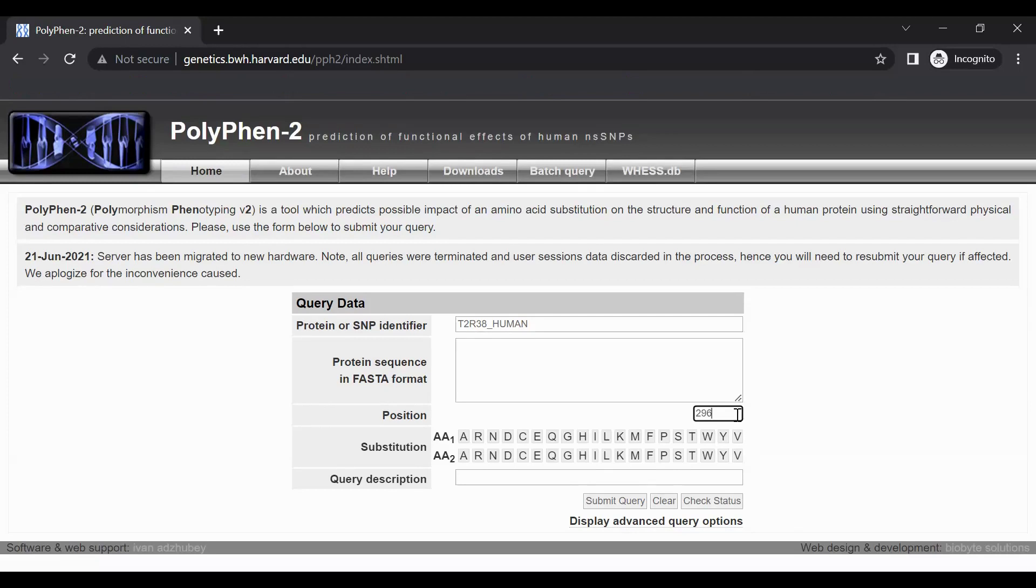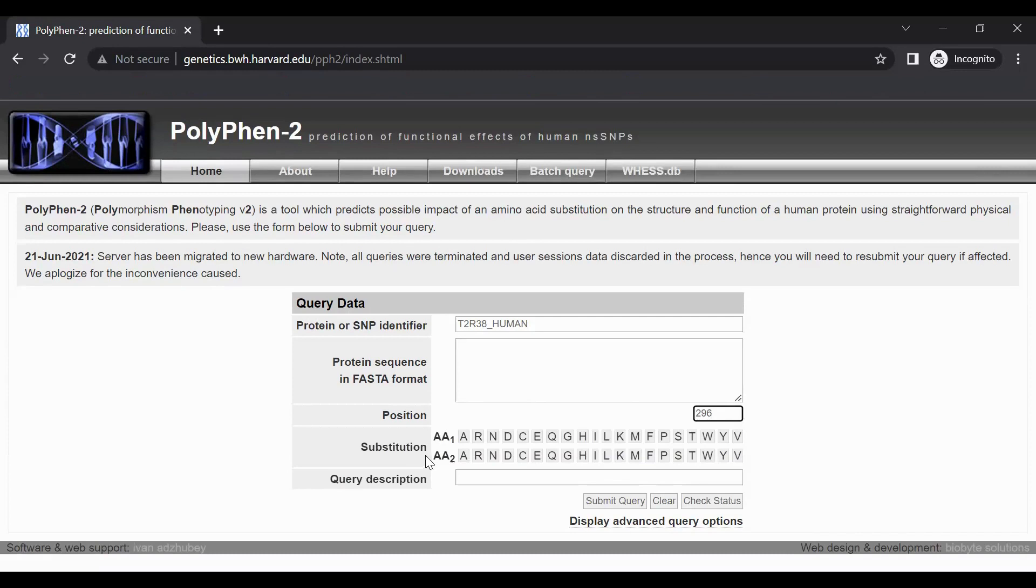Below the position box are two rows labeled substitution, then AA1 and AA2. This section of the form enables you to enter information about the amino acid change. Both rows contain a list of all of the amino acids represented by one-letter abbreviations.